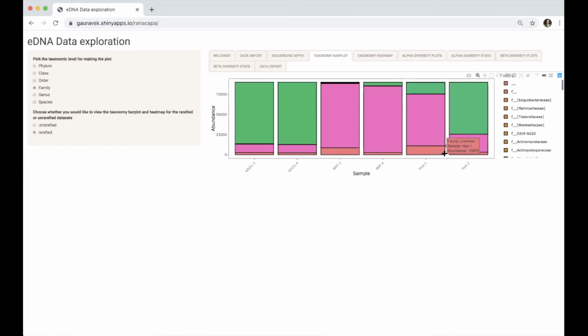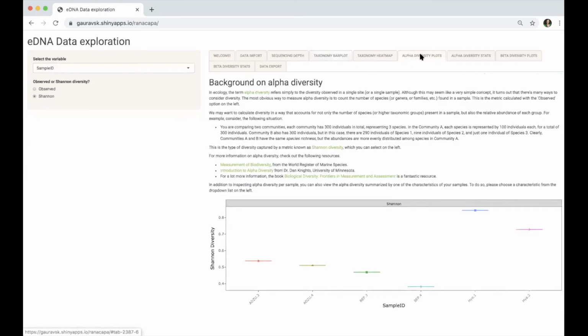So when we're comparing the diversity of these two samples, hyacinth and BEP, hyacinth gets calculated as being more diverse than the BEP sample because it's not as highly dominated by a single organism as the black-eyed pea samples. So going back to the plots here, basically that's what we're showing here, comparing the different Shannon diversities across the different samples. And if you click on there, you can see the actual value that the Shannon diversity was calculated at, and you can see how they compare.